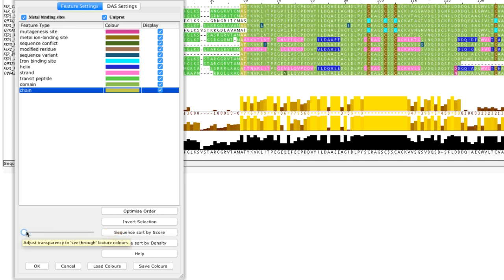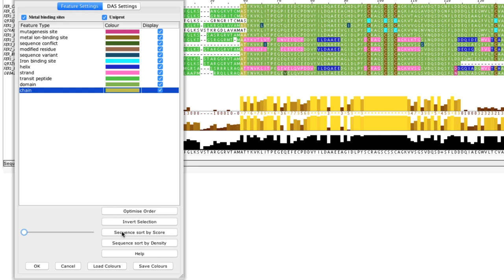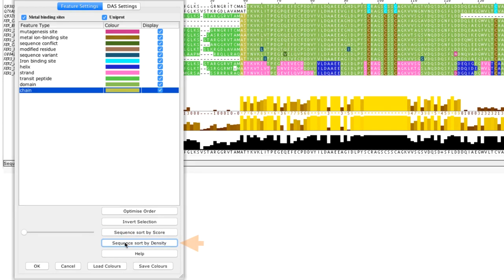I can use the display features to reorder the alignment. For example the sequence sort by density reorders the alignment according to the number of sequence features present on each sequence.